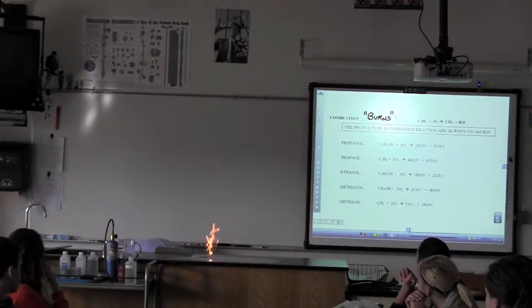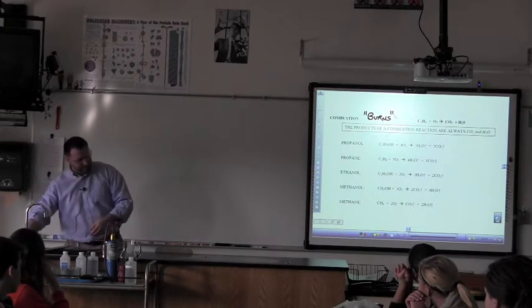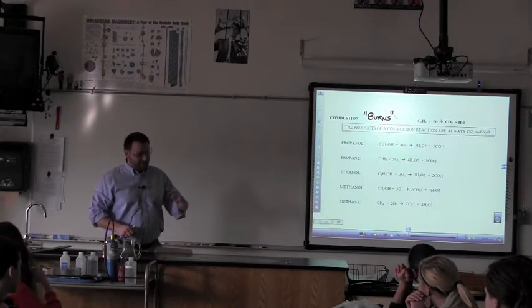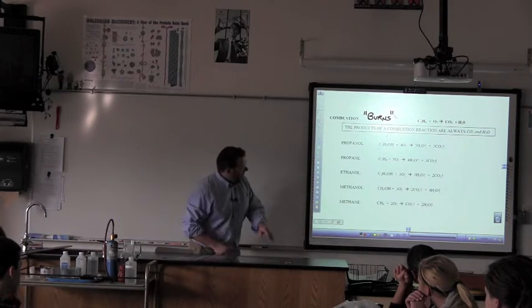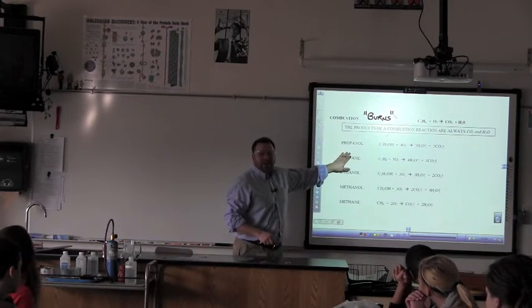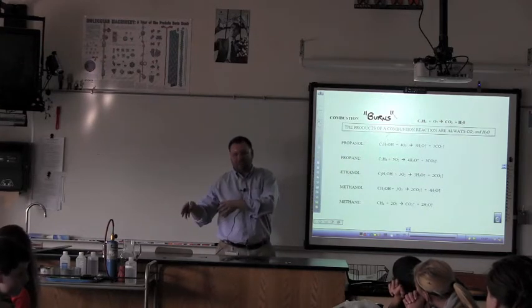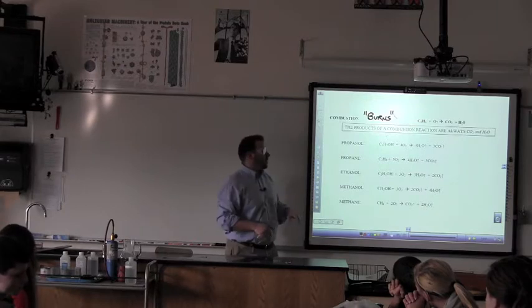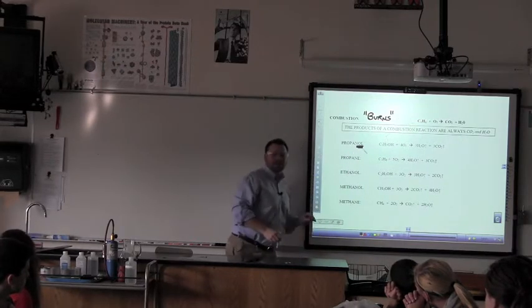All right. Now, I dropped a few matches, so I'm going to pick those up and put them off to the side. That is obviously the first part of combustion day that we want to tackle. The other thing that I want you to notice is take a look at this. We're using propanol. It's not exactly isopropyl alcohol, but for our purposes, it's good enough. Propanol has that little OL on the end. Do you remember what that means?